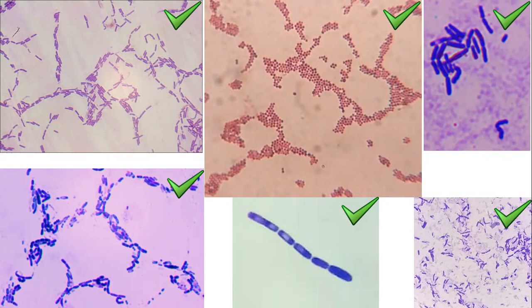Usually, in my experience, I see whether the bacteria is spore-forming or non-spore-forming. You can determine this easily during gram stain. For example, see here. You can clearly see a vacuum space within a cell, and only the polar region of the cell has been stained. Usually, this is an indication of endospore formation. Even here, it is visible. Here it is not visible, so I don't know. Once you subject these bacteria to a spore stain, you will see the endospore.